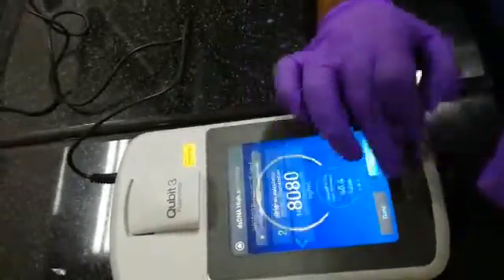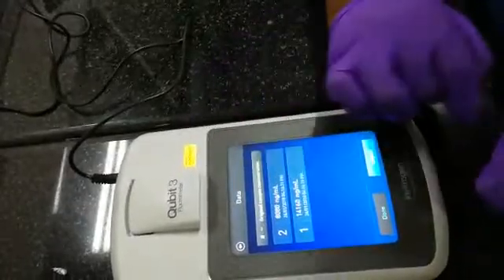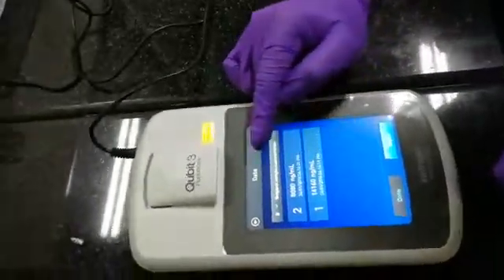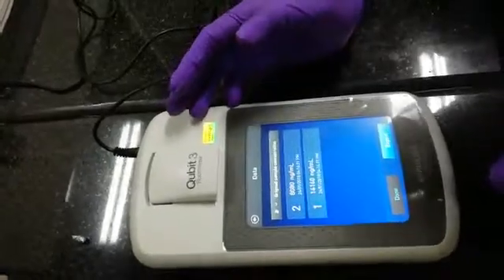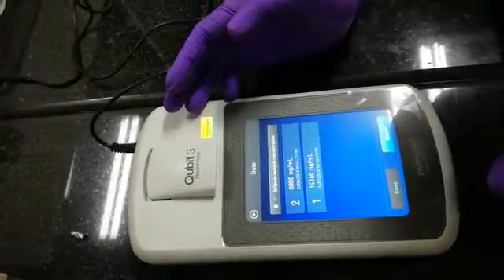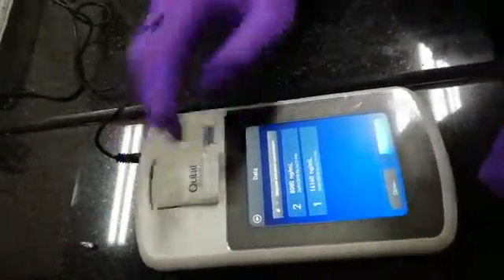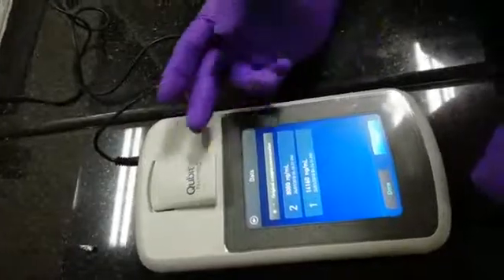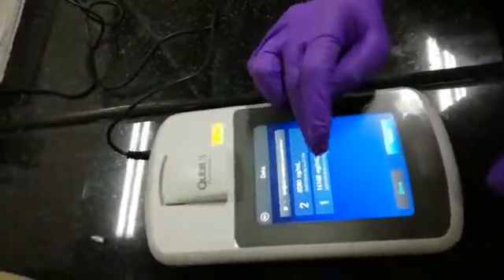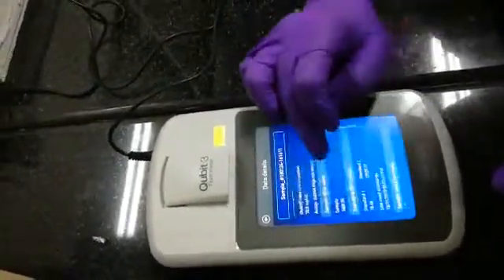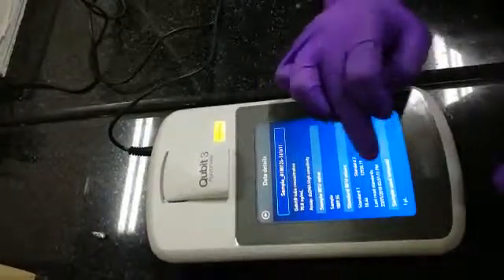If you go to data, you will get the information regarding your samples. The data will be stored automatically on your setup. This is the way how we use the Qubit fluorometer. You can come and directly check your sample value.